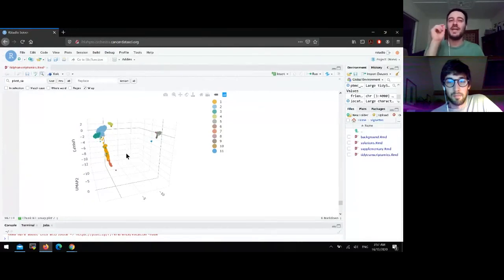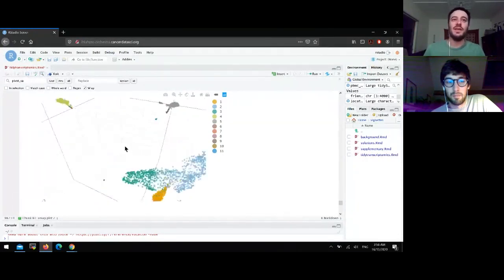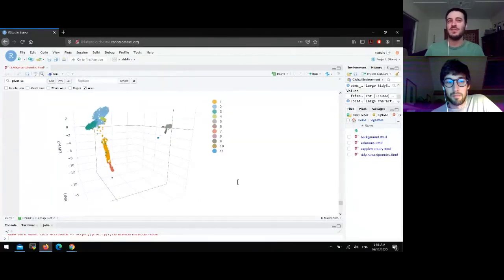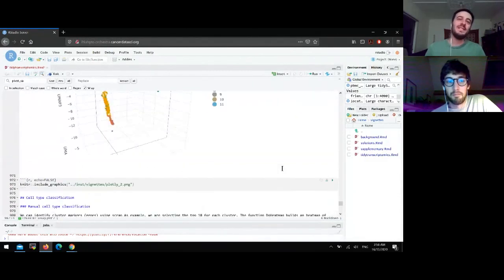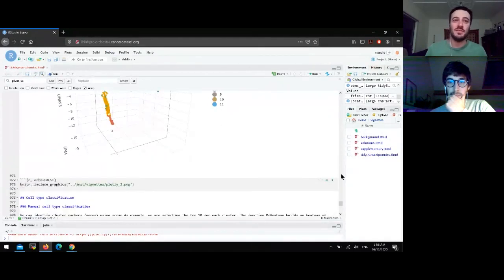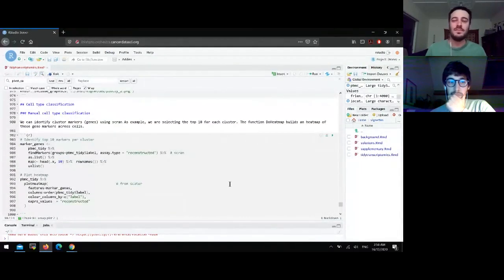Clusters are much better resolved visually and less overlapped if we also visualize the third dimension. And you can better zoom in and realize the relative position of clusters, especially when you have a lot of data. This is just an example of how a tidy-friendly data representation can open up a lot of possibilities with the huge ecosystem that is the Tidyverse.